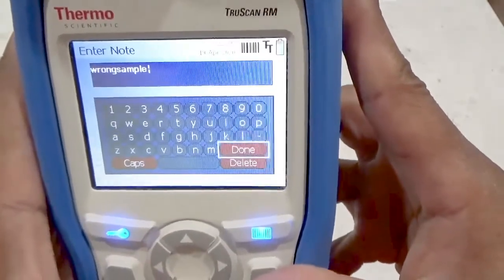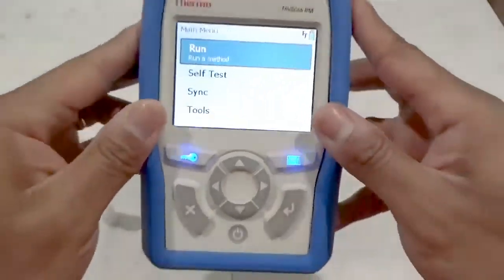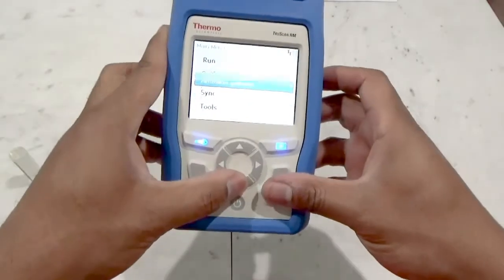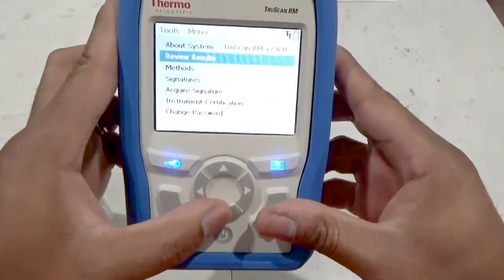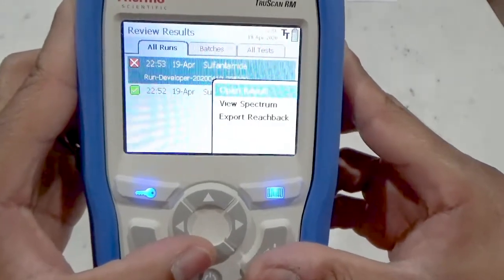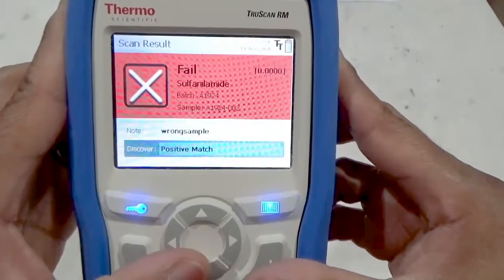Press the cancel button to return to the main screen. Selecting the tools menu function and then review results allows a developer or administrator to review the data that has been collected. Here we see our failing run with the note attached, as well as the positive matches that were found.